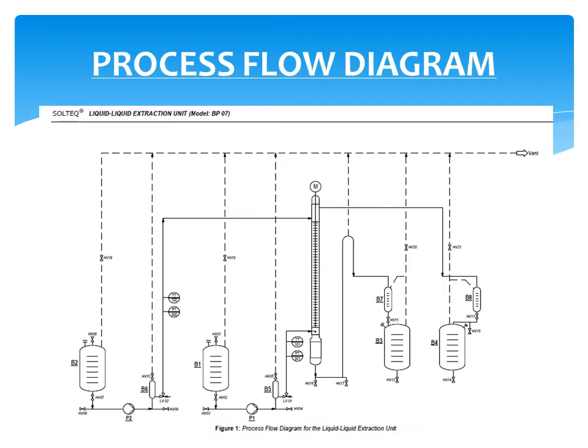Next, record all that data in the sample table provided in Appendix A. Next, stop both pump 1 and pump 2. Last but not least, repeat the experiment from step 3 to step 10 by turning on the rotating disc stirrer and setting the stirrer speed at 250 rpm, but fix the same flow rate and feed composition throughout the whole experiment.